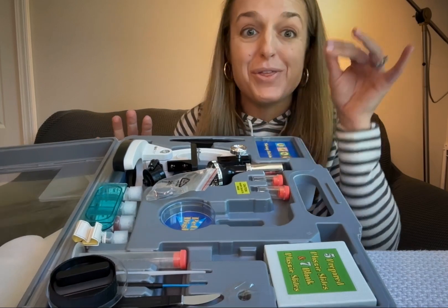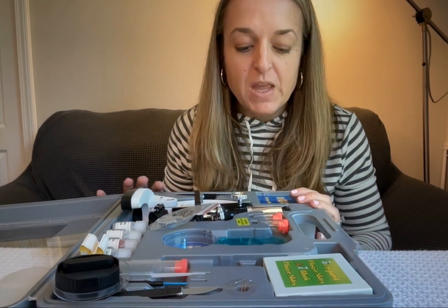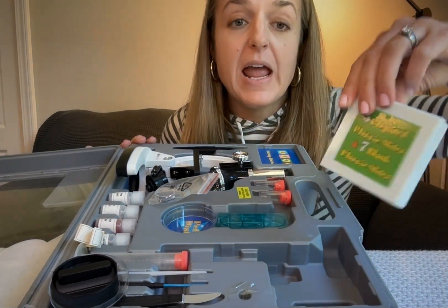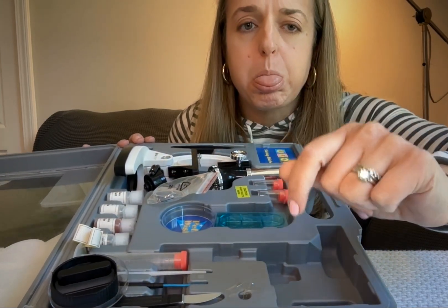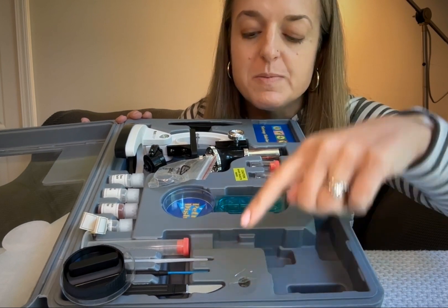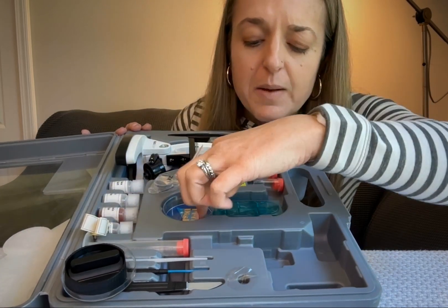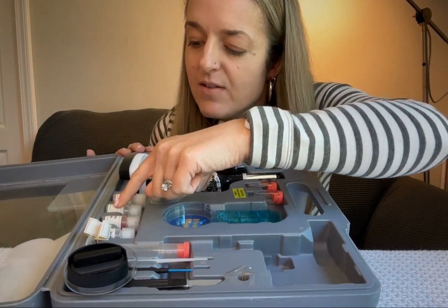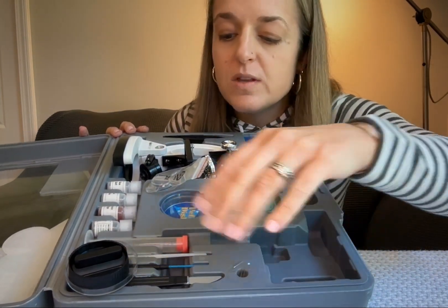You're going to want to store your items in this case, because inside there is a little groove and a little area that fits each individual item, so it helps keep everything organized — there's a certain spot for everything, which is fantastic. We've got tweezers, pre-paired and blank slides, slide covers, a little scalpel-type tool, different little sticks to poke around with, a replacement light bulb for the microscope, two little tubes to collect things in, a petri dish, a slide that can hold something larger, and some different kinds of liquids, plus slide labels.